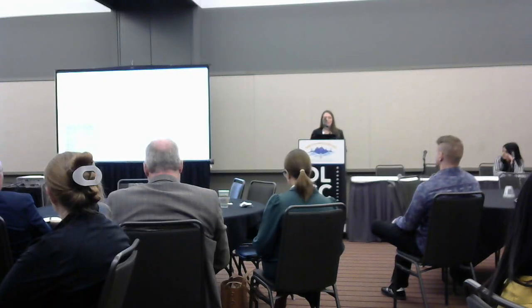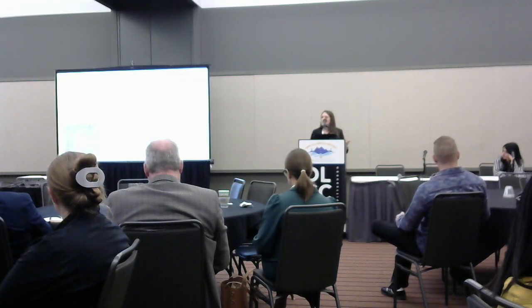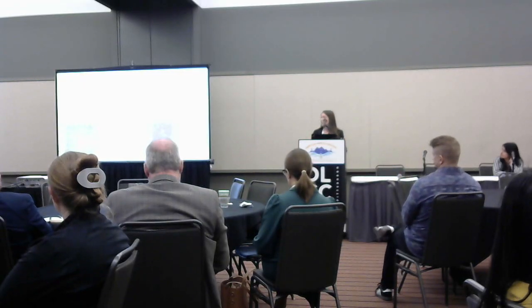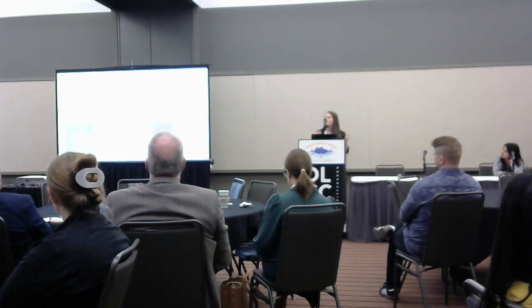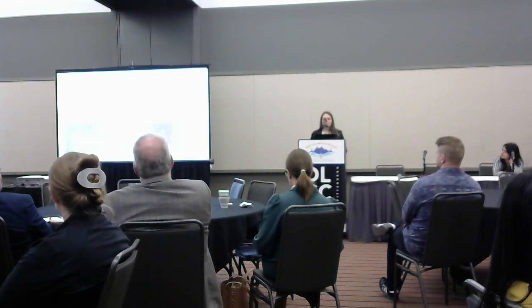And then lastly, how do we use the values in the image to actually derive information or meaning about biology? So for example, we can use intensity values to tell us things like where objects are, so object segmentation, or measure intensity of objects, so how much stuff do I have? What is the relationship of that stuff?